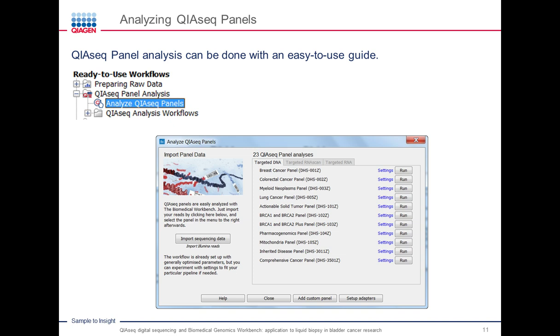So now we jump to the bioinformatics, and it is very important to stress that in order to leverage these advantages that I just showed in the use of advanced technologies in the molecular biology part of your workflow, it is important to have a bioinformatics solution that is able to use that barcode and to perform the analysis by doing what I just showed you, which is understanding how the reads should be grouped and how they map to the original molecules you started from.